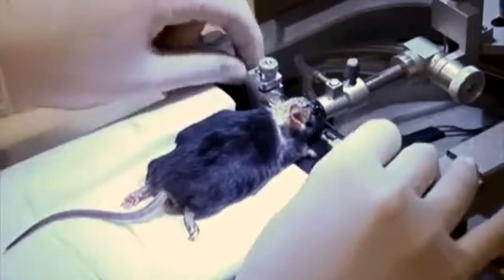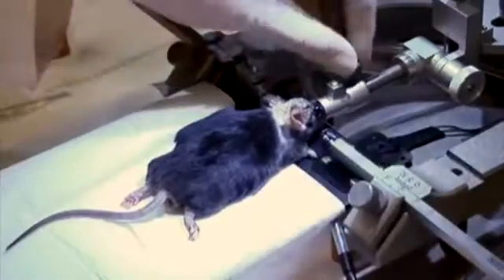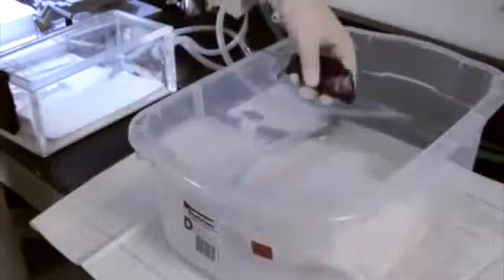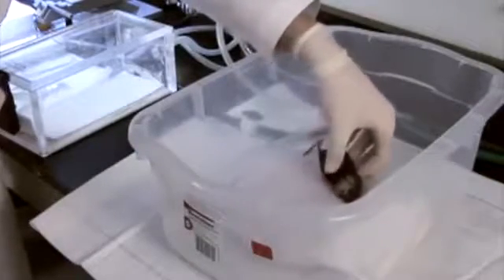Unscrew the ear bars and loosen the nose cone. Remove the mouse from the stereotax and place on a warming pad for recovery. Monitor the mice daily after the surgery to check for pain or discomfort and infections, and treat as necessary with analgesics such as carprofen, according to an approved protocol.